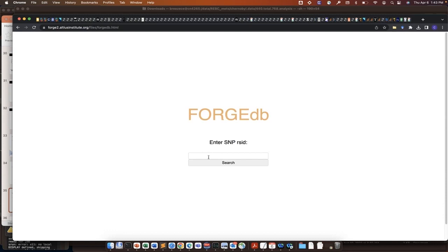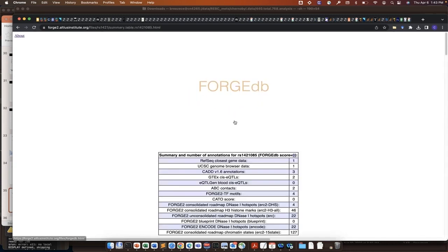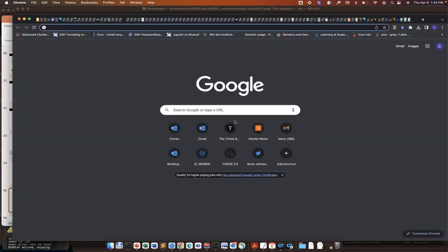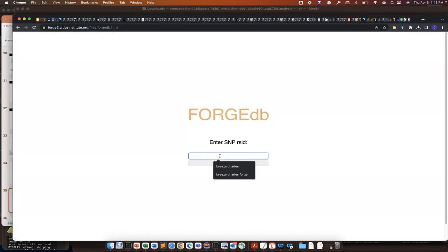This is why I'm saying that a score of a 7, for example, is not a bad score. We have to look at each layer of evidence and say, why is this missing? And maybe it's because it hasn't been analyzed. Sometimes people have done windows around promoters to analyze SNPs. This SNP is very close to the promoter, so it's definitely a simple eQTL too, but it just isn't available in GTEx data for some reason. Not all SNPs are available in all data sets, so that's another limitation. So this particular variant is very interesting.